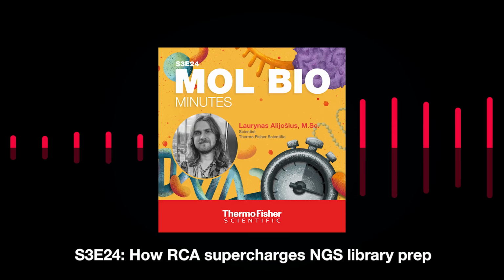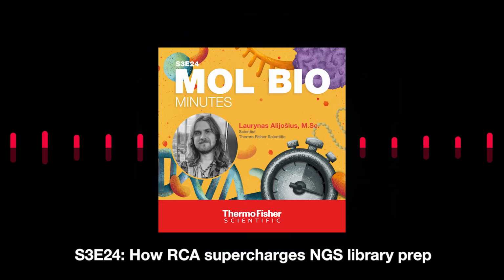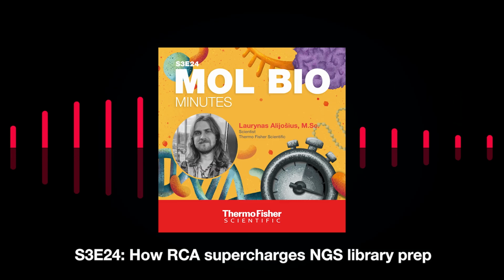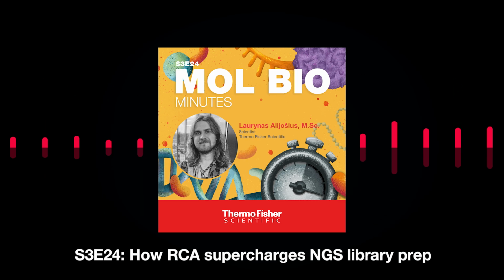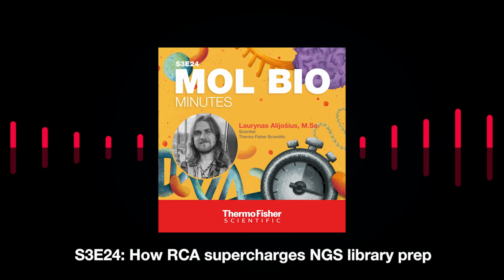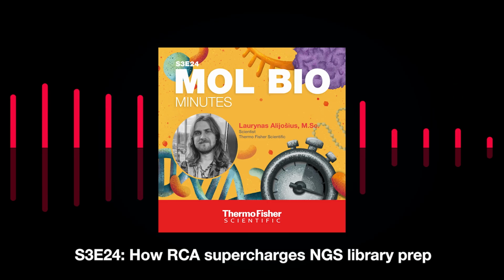So, once upon a time, in a lab not so far away, I wanted to sequence and analyze the circular DNA genomes of some viruses. But I had a problem. The amounts of the extracted DNA material were always very low, so I couldn't prepare a library for the next generation sequencing of these viral genomes. So that got me thinking, what can I do?